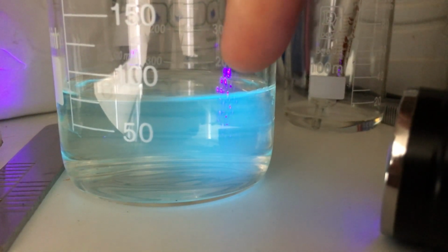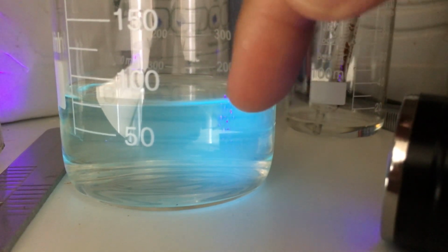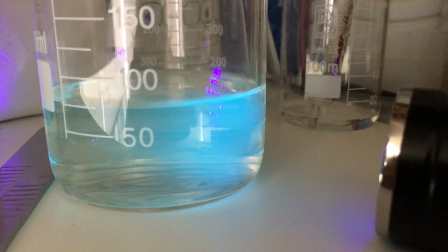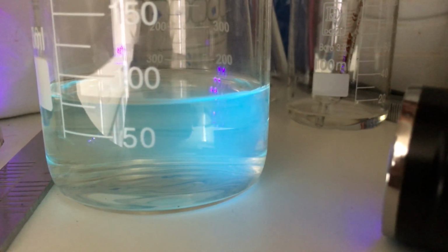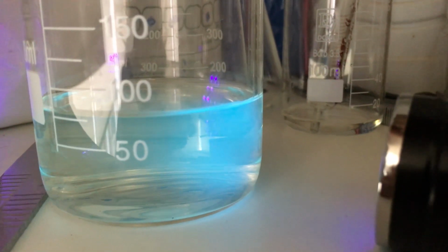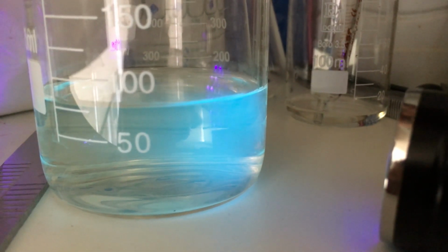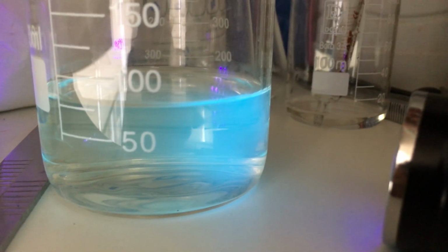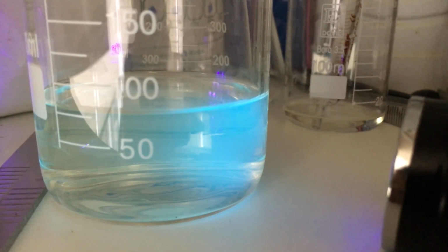And just as a fluke, I did it, and I do think it worked. You can see there's a clear blue hue where originally it was green. But again, I have to repeat this since I didn't do any control or anything. So that's what I'll be doing in this video. If you have a better understanding of the process, try to explain it in layman's terms to me. I would appreciate it, but this is what I'll be attempting.